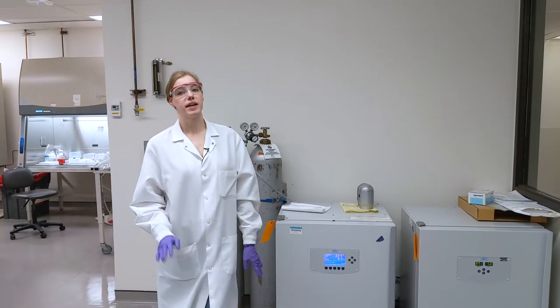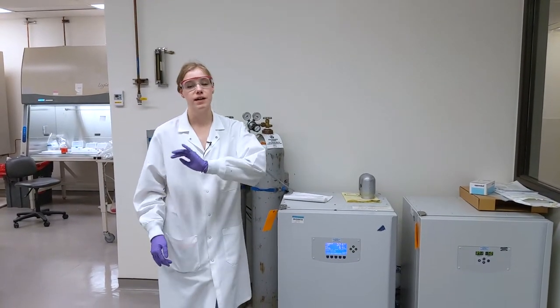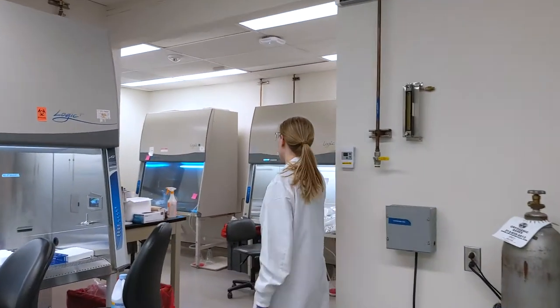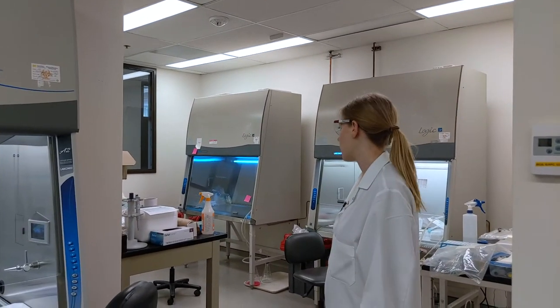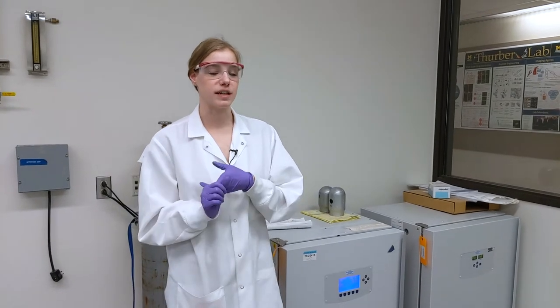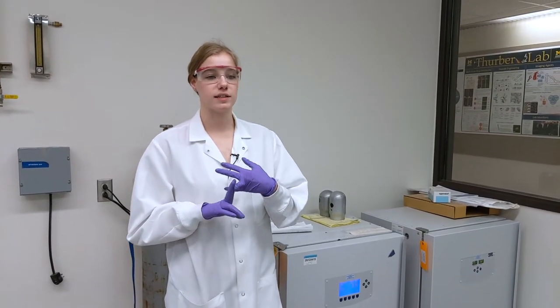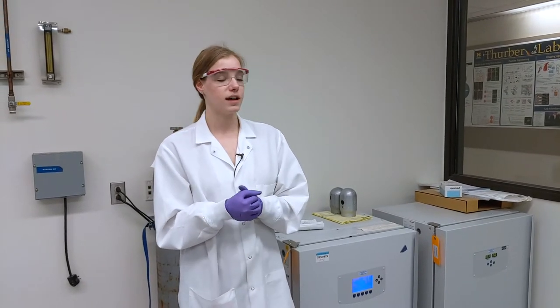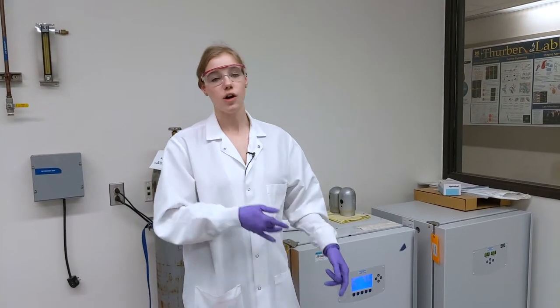So we're here in our mammalian cell culture room, which is a space that we also share with the Wen Lab. We have an incubator here where the cell babies live, and then we have two biological safety cabinets over there where we do our cell culture work. Some of the other equipment that we use, as we saw earlier, we use the HPLC, but we also rely on flow cytometry that the Wen lab showed us as well as microscopy and a few other techniques. So what this lets us do is look over multiple length scales and biological systems. On the confocal microscope, we're able to see subcellular resolution, and then we can go all the way up to whole animal resolution on the systemic scale there.